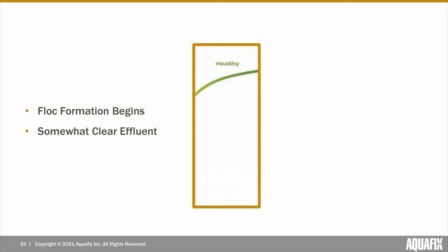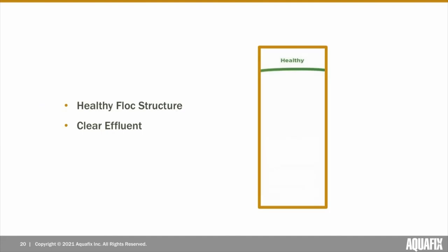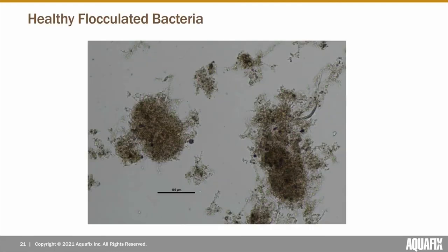Bacteria are now able to begin settling and creating a less turbid effluent. Once we reach a healthier sludge age, ideal flock formation will occur, resulting in efficient settling and a clear effluent. Here's an example of what some healthy flocculated bacteria look like — the flock are variable shapes and sizes, and minimal free bacteria is present. After looking at the size and shape of flock, we will further analyze how well oxygen is penetrating into flock, as well as the strength of flock structures.